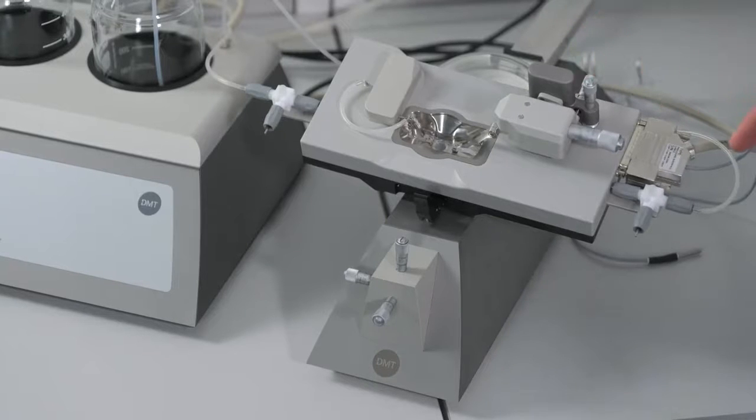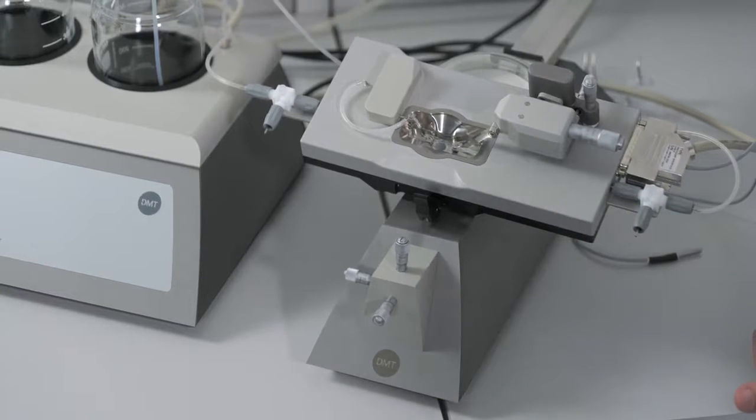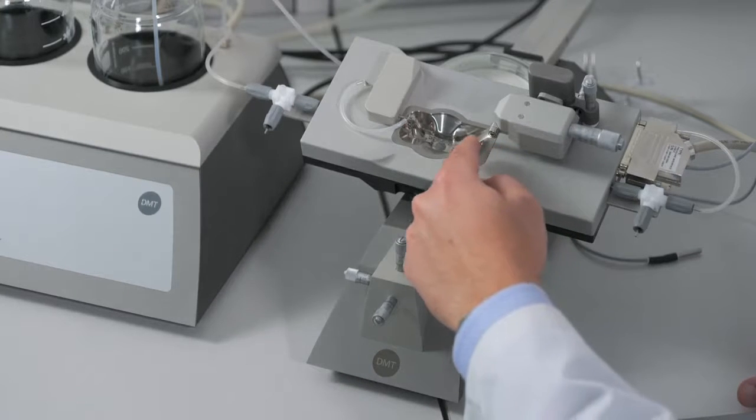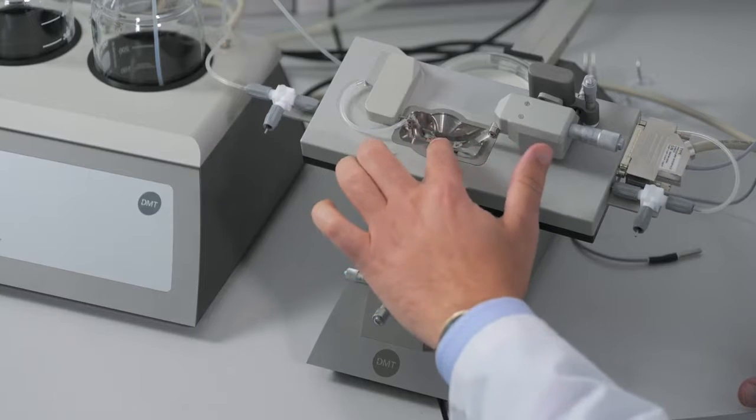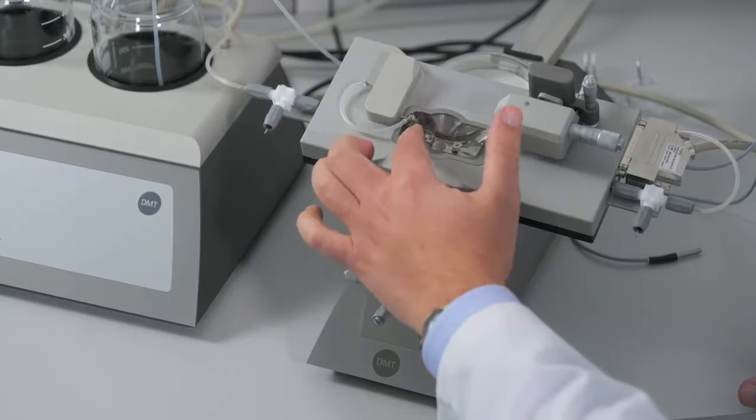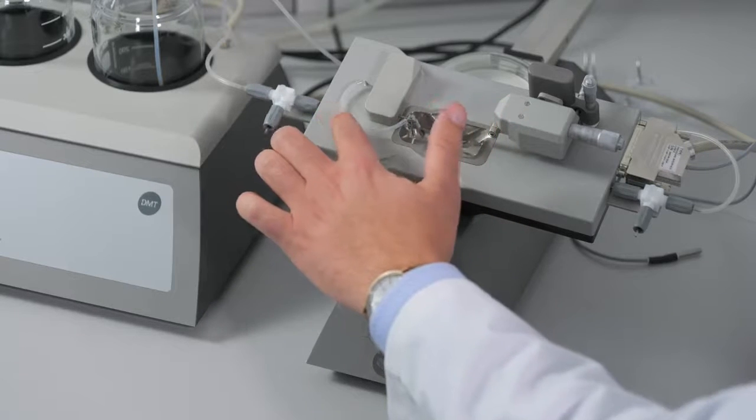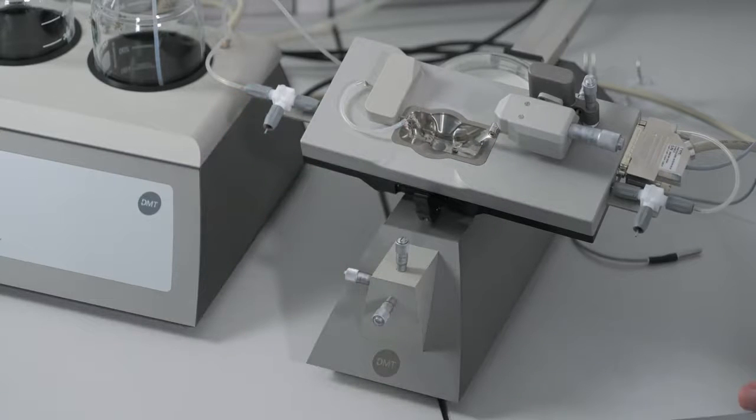The pressure will enter from the right side. It will pass by an internal pressure transducer that allows you to accurately monitor the pressure that your vessel is seeing. The pressure will pass through the right side tubing and cannula, go into your vessel, leave via the left side cannula and tubing, pass by a second pressure transducer, and leave on the left side through the three-way valve.